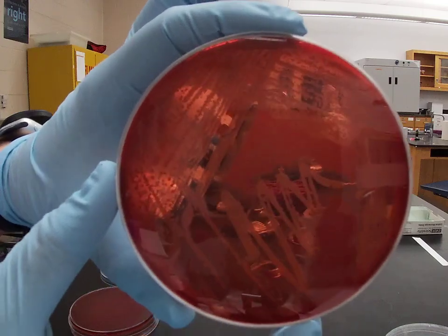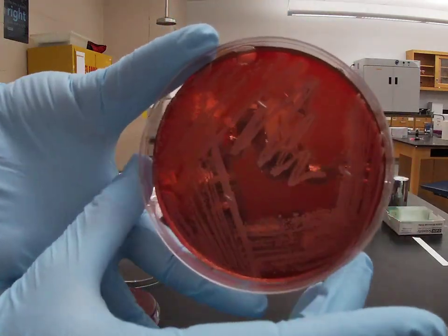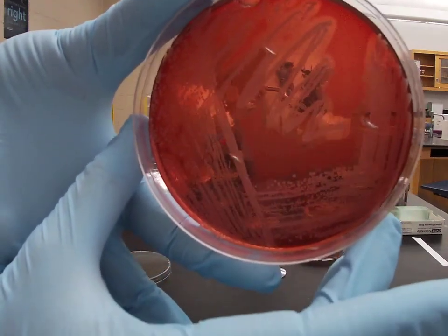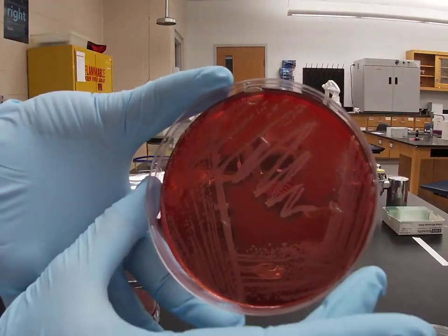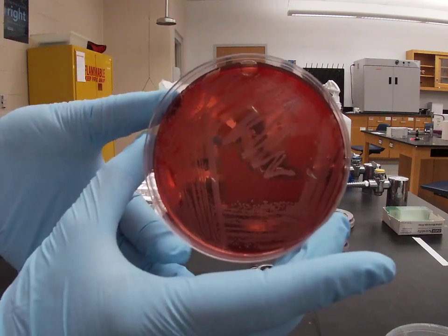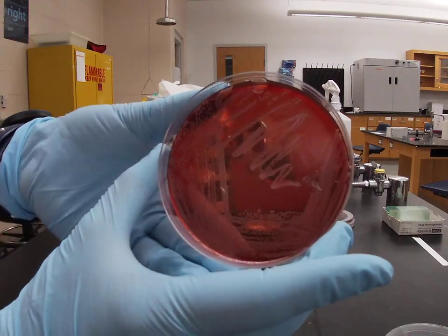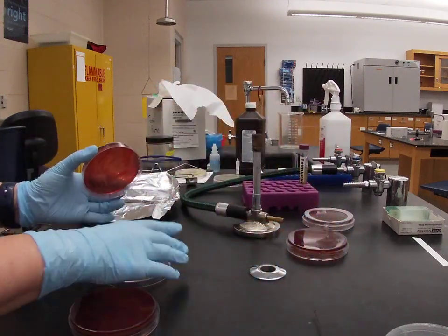Here you can see everywhere that the bacteria are growing, you can actually now see through the agar in those areas. I like to take a blood agar plate and even put it against something with writing on it, and you can actually read through the cleared areas of blood agar. So if you see blood agar with clearing, this shows you complete hemolysis.